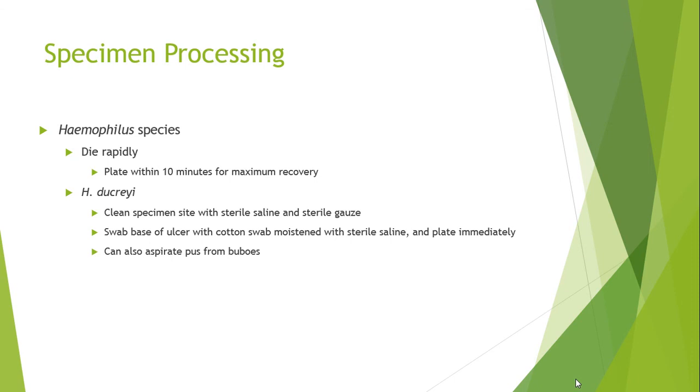Yes, you're welcome. Specimen processing for this organism, for Haemophilus. Remember, it dies very rapidly. It's fastidious, right? Very sensitive. So we need to plate it within 10 minutes for maximum recovery. It's got to get to the lab quick.